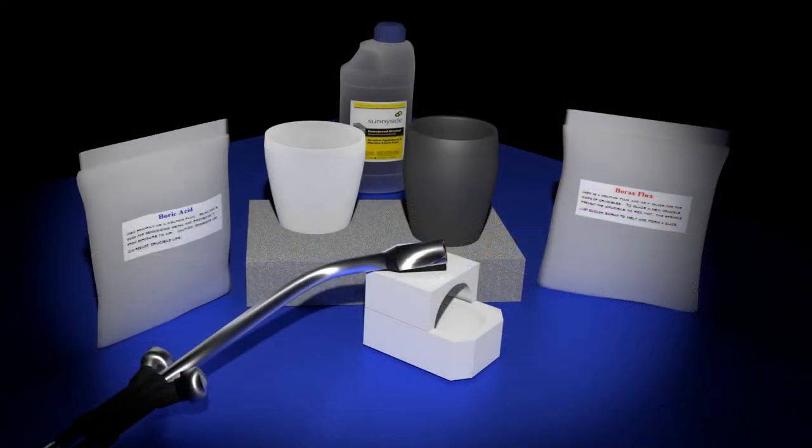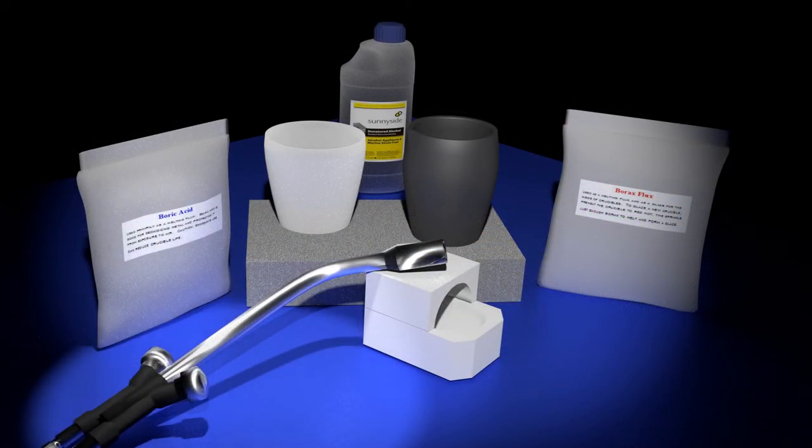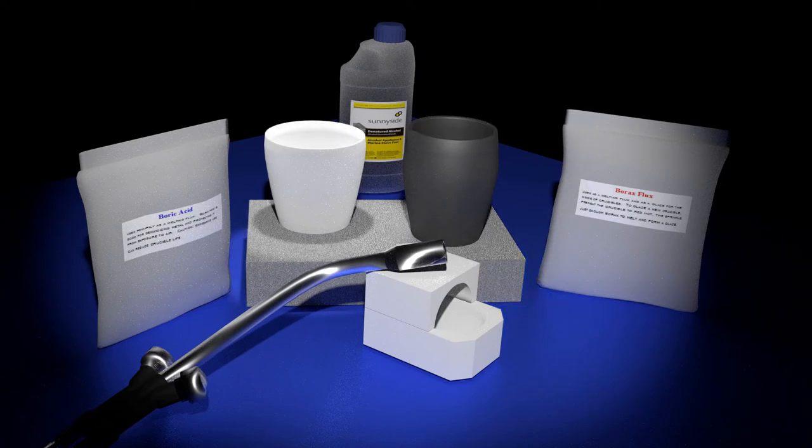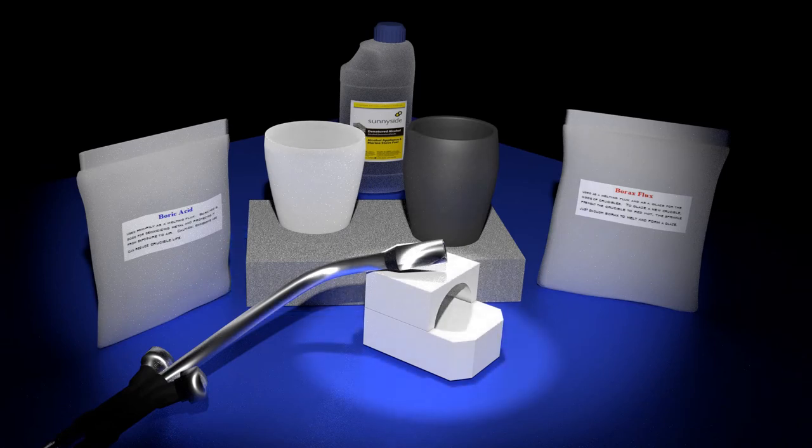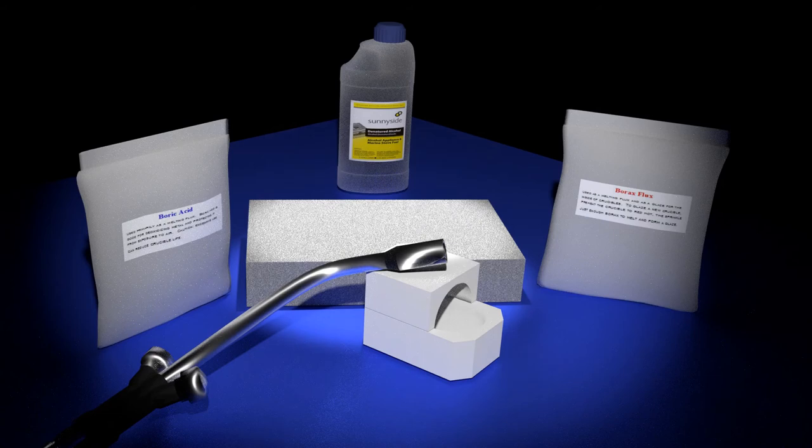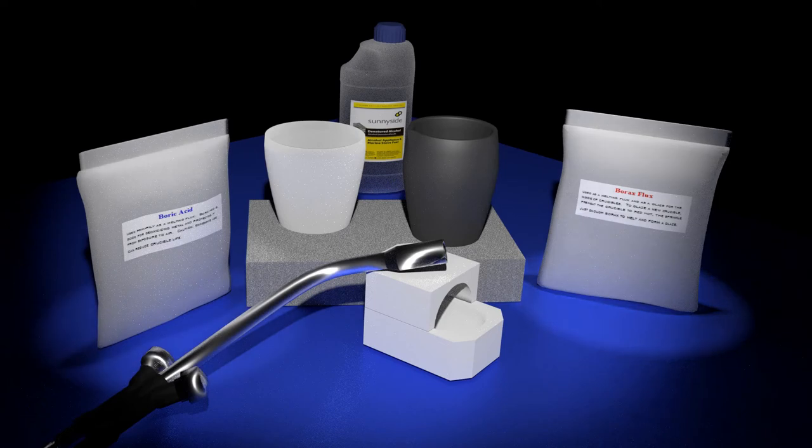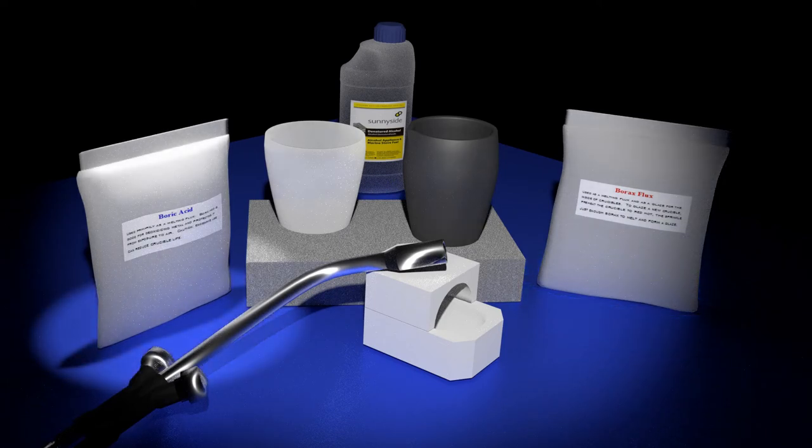Here is what you will need. Melting torch. Use a torch made for this purpose. The common propane torch simply will not provide enough BTUs to do the job. Crucible. You can use a standard clay graphite crucible, a ceramic cup shaped crucible, or you can use a burner ceramic crucible. Crucible rest. Any refractory material, like a brick or a cinder block for example, will do the job. Flux. Common fluxes that are typically used include borax, boric acid, or a combination of the two. Alcohol.